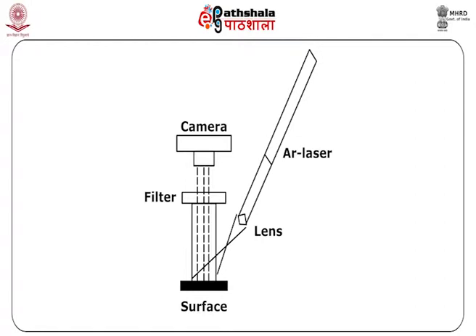Such filters absorb the short wavelength components and transmit the longer ones, thus protecting the observer's eye. After the fingerprint is identified, it is photographed through the same filter. The identification of the fingerprint as well as its photography is carried out in a dark room. A flow diagram for laser detection of fingerprint is shown in the given figure.